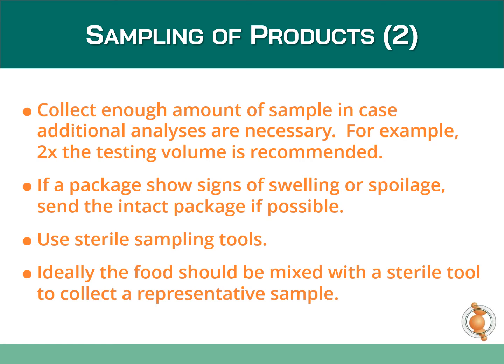Always use sterile sampling tools while collecting samples. And ideally, food samples should be mixed with a sterile tool to ensure a representative sample was collected. The tool used to collect the samples must be sterile so that the sample is not contaminated.